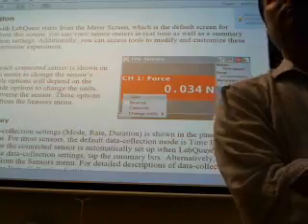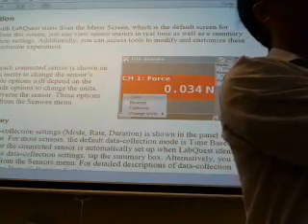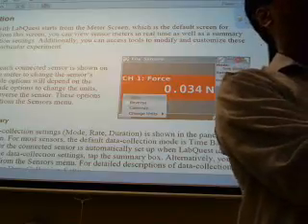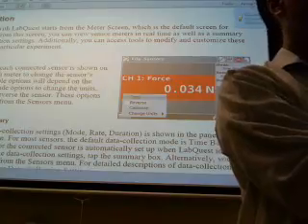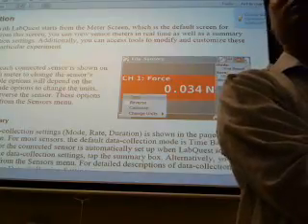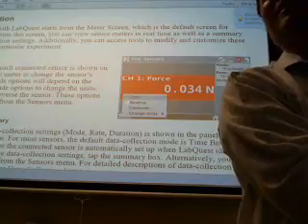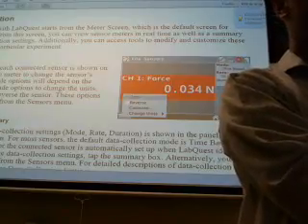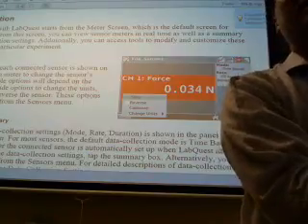Wait, can you say that again? Tap on the sensor reading, the digital output. Tap on that and see what options you have. What options do you have? Change units. Just tap on the temperature, anywhere on the temperature. Tap on that. Do you see we can change the units? Right now it's 71.3 degrees Fahrenheit in this room.